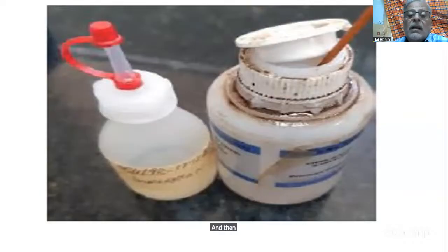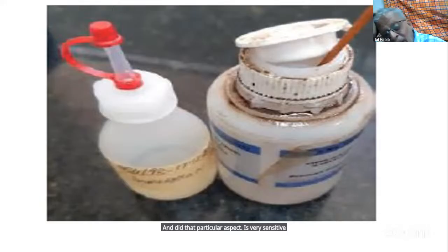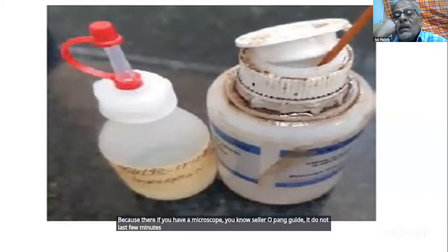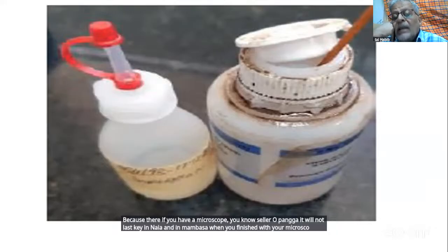And that particular aspect is very essential if you are in areas like Mombasa, because there, if you have a microscope which is not sealed for fungi, it will not last even a year. And in Mombasa, when you finish with your microscope at the end of the day, you don't leave it on the bench.